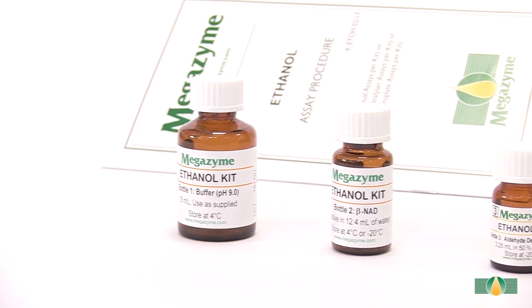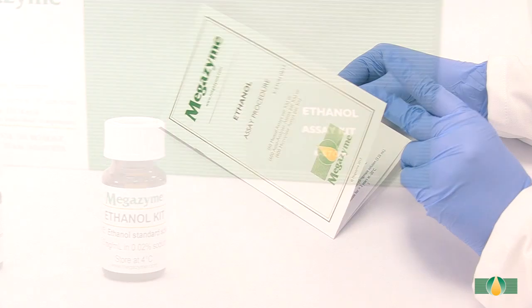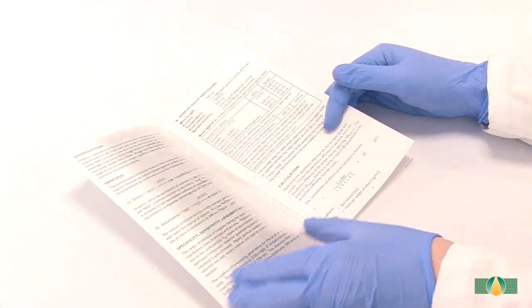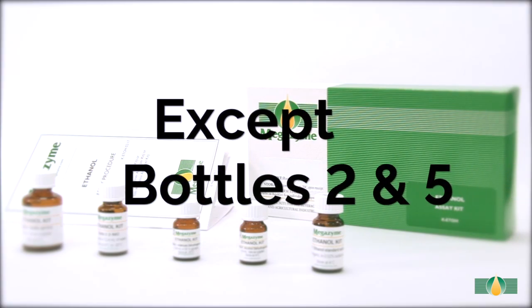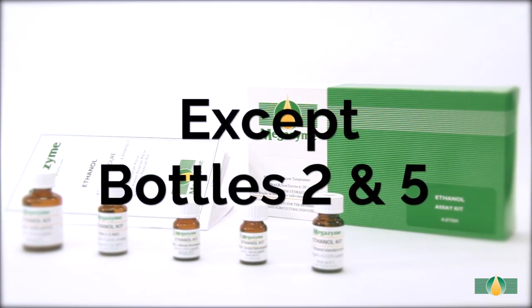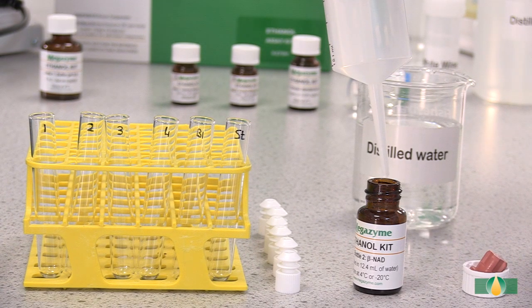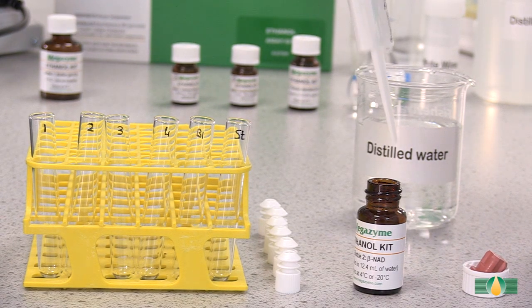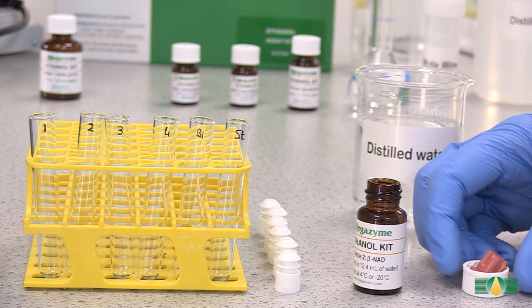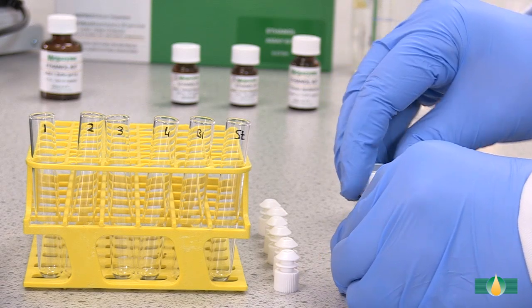Prior to sample analysis, the kit components should be prepared as described in the kit data booklet and once prepared they are ready for use in the manual assay procedure. All of the kit components except bottles two and five are used as supplied. The contents of bottle two are dissolved in 12.4 milliliters of distilled water. The bottle is capped and the contents are mixed thoroughly to ensure complete dissolution.